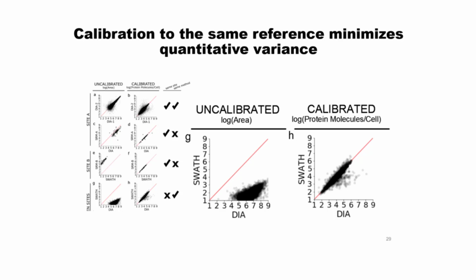So they kind of had the amount of cells reported? No, it's just done by the same amount of protein from a BCA assay, from one versus another. So it's just a lysate. In fact, I think we actually started from the same cell pellet, but we may have homogenized the cell pellet together with another pellet. We measured the density using OD. We had matched the OD. We homogenized them together in the same batch. We then digested them together. So that's the key thing.